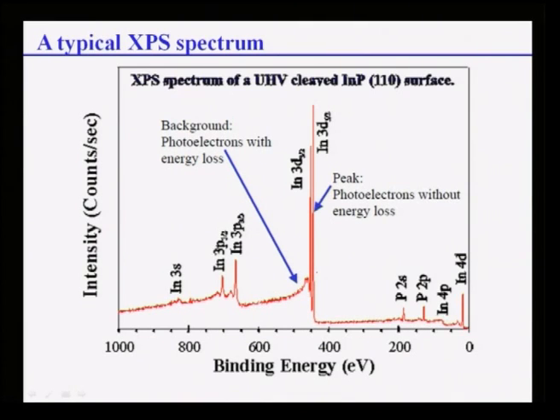Typical XPS spectrum for indium phosphide 110 surface. As you see here, you see only indium and phosphorus peaks. You see indium 3s, indium 3p 1/2, this is 3p 3/2, 3d 3/2, this is 3d 5/2.